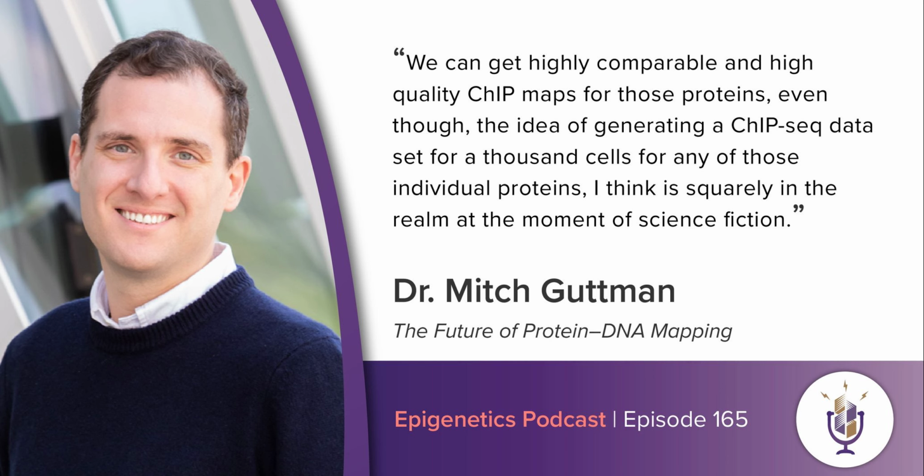So if it's a target with a very low abundance, you could, because it has been done in the past, maybe fix the antibody to chromatin, because I think if you pool your things again, you mix, the antibody might fall off chromatin again. Right. So did you test something like that, to fix after the IP? Yeah, we actually have thought a lot about that and thought about whether that would be something that we needed to adopt. In practice, we haven't, and because we haven't needed it, in fact.